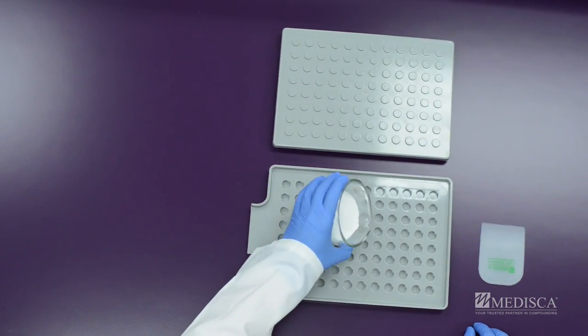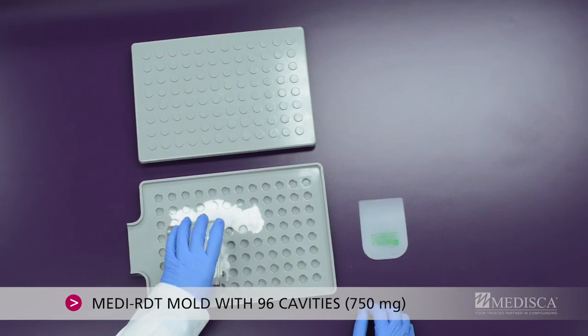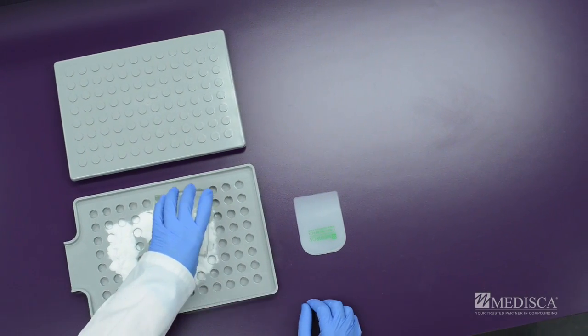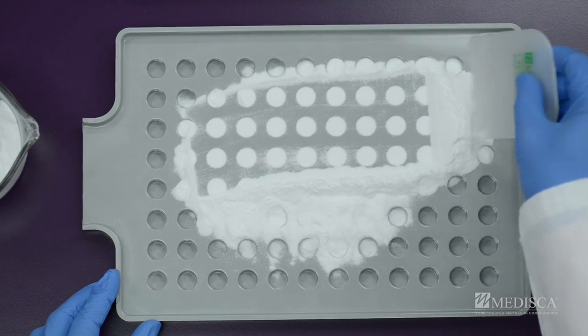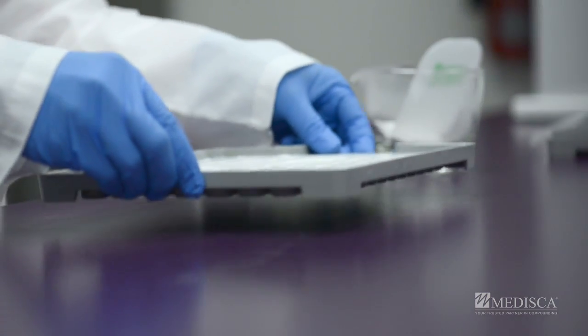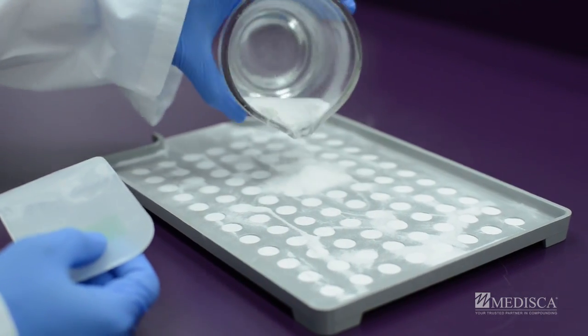This one in particular is a 96 cavity mold with a 750 milligram volume. Let the filling begin. Pour half of the powder mixture onto the mold and spread it over the cavities. Gently tap the cavity plate on the counter to settle the powder, then add more mixture to completely fill the cavities.